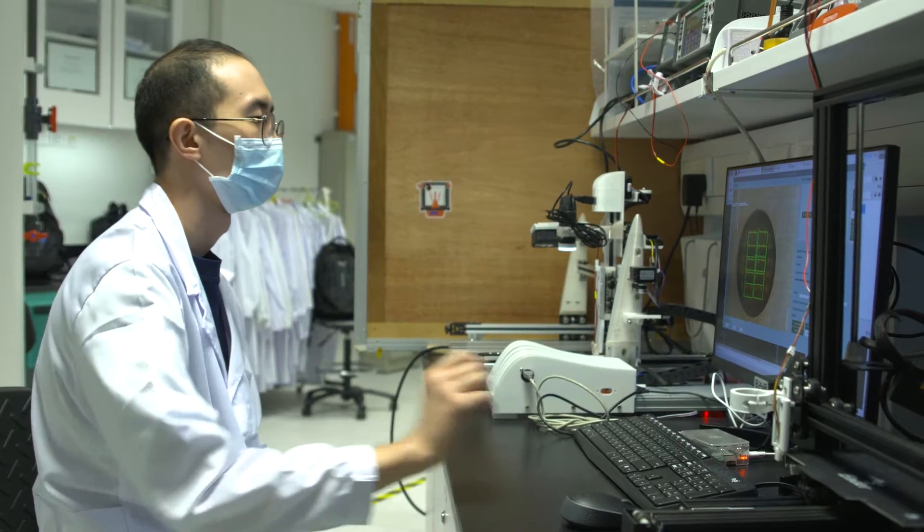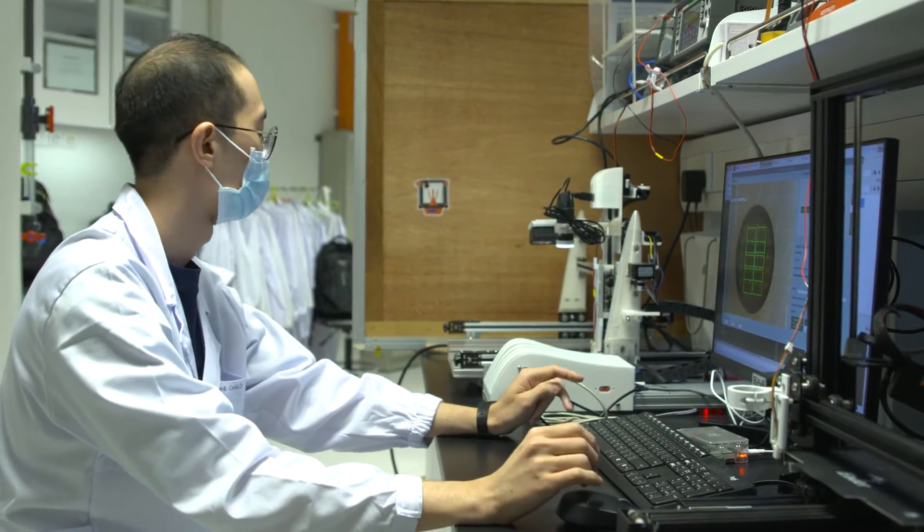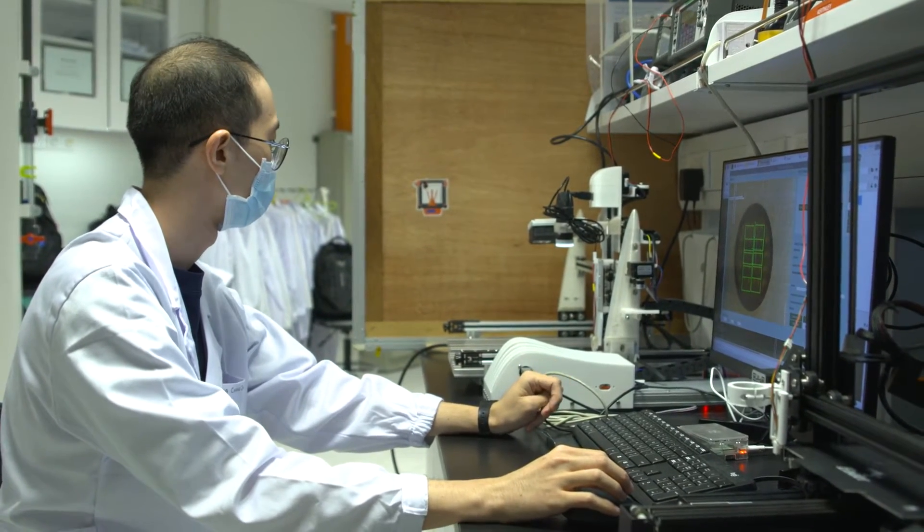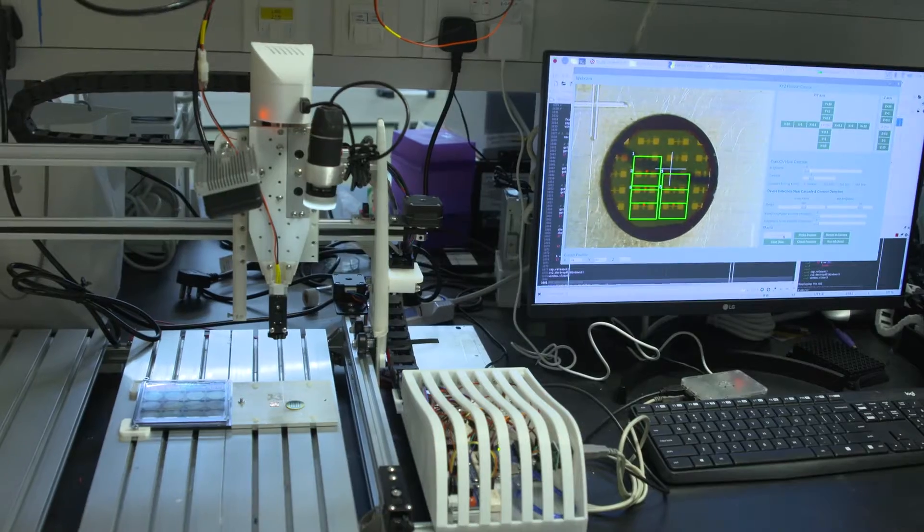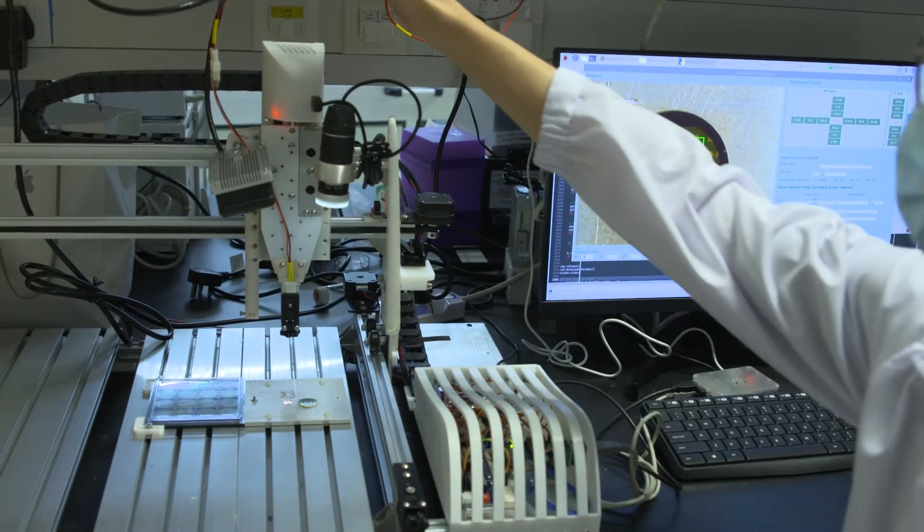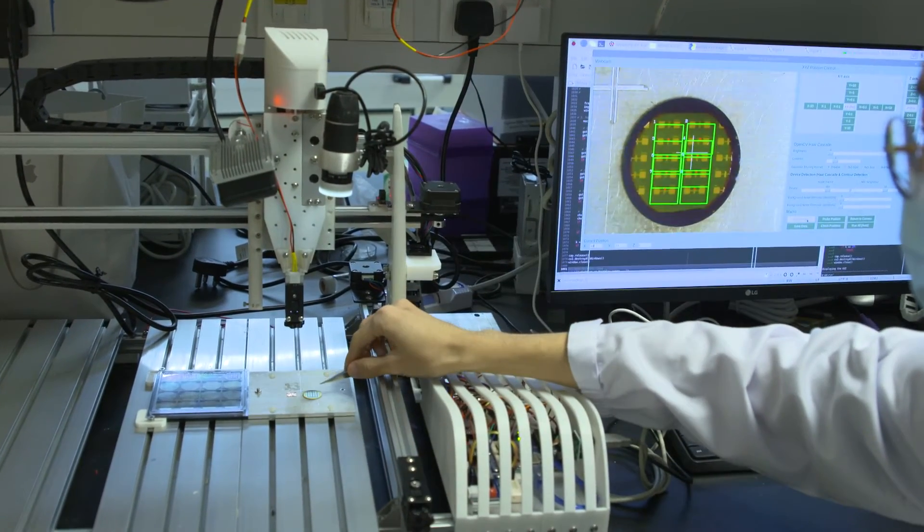In recent years there's been a large open source hardware movement and development of many programmable logic controllers that are very accessible. Every time someone develops something new we can integrate it. We also share with the world what we develop here and together we can build this whole ecosystem that is helping each other do better materials research.